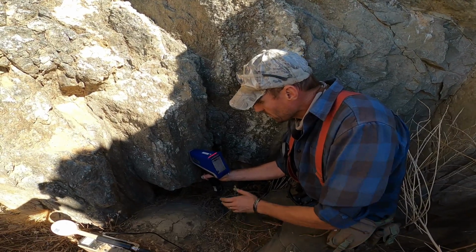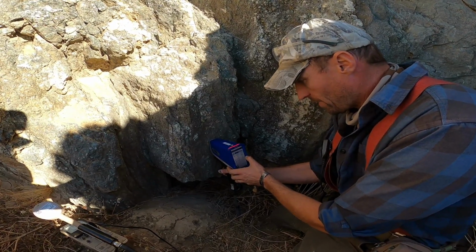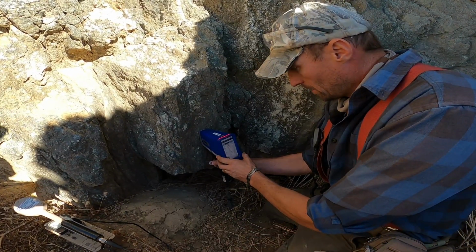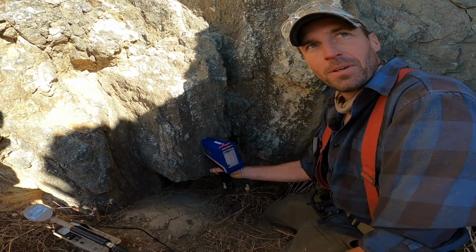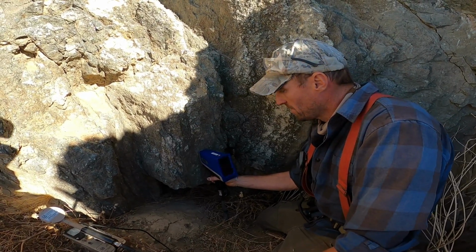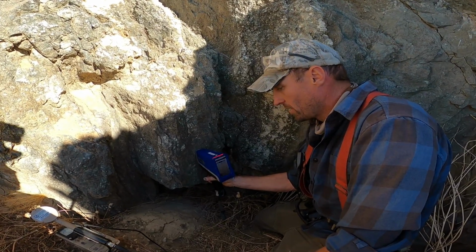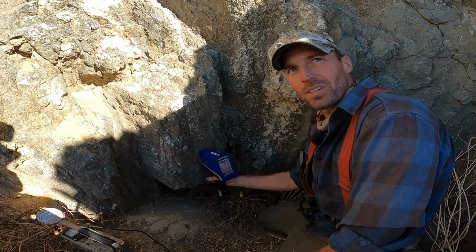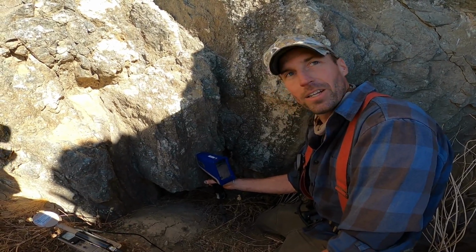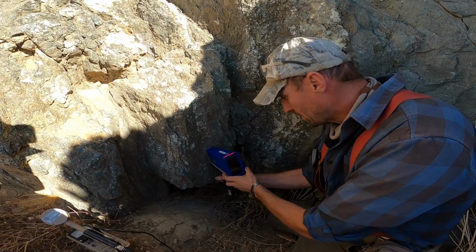So I got through the first beam, and there's iron, titanium, barium, and manganese are kind of the main players. Yttrium already showed up, and it's not even looking for it yet, really. What's nice is now we can see potassium. We were reading about potassium and the pegmatites and the potassium carrying the rare earths. That's like 4%, dude. That potassium's radioactive too. Wow. It's on the tree of radioactive decay, right? It goes uranium, thorium, and then like 20 other different elements, and then you end up with lead at the end. So that radioactivity isn't just thorium, it's potassium.